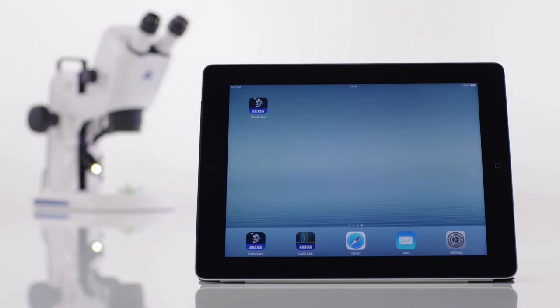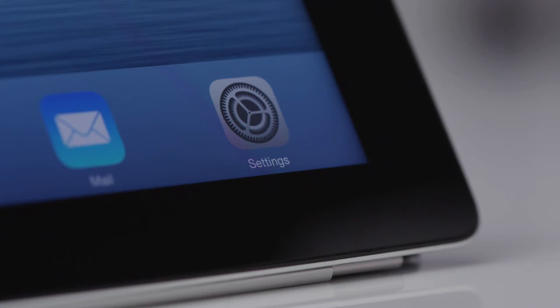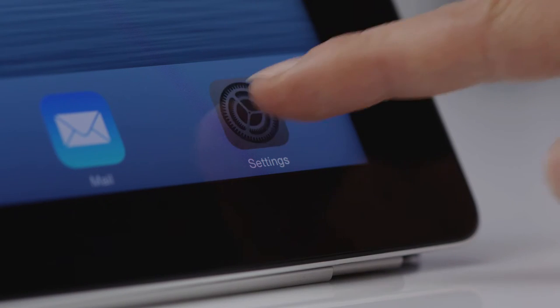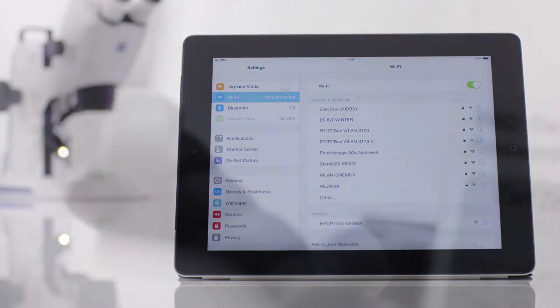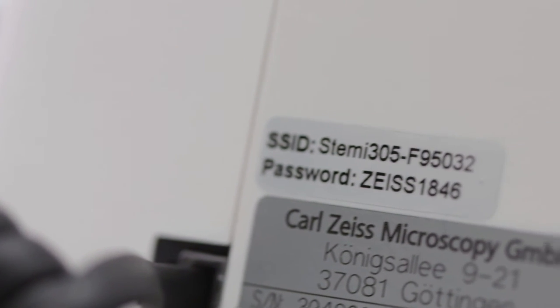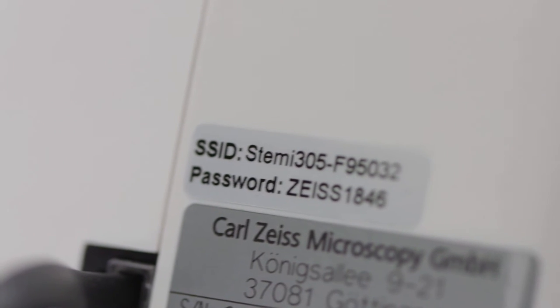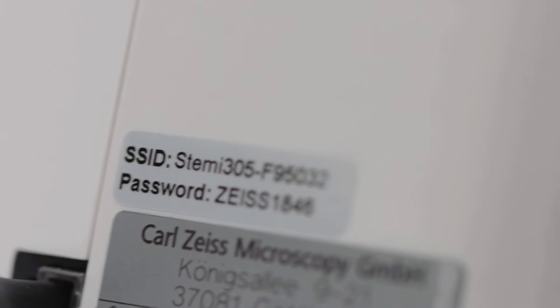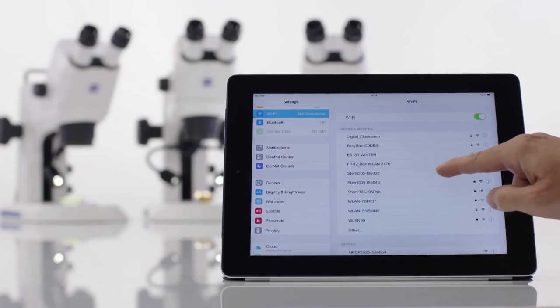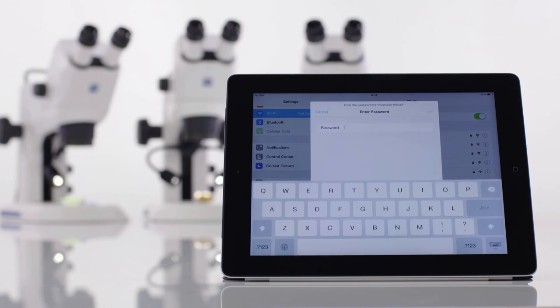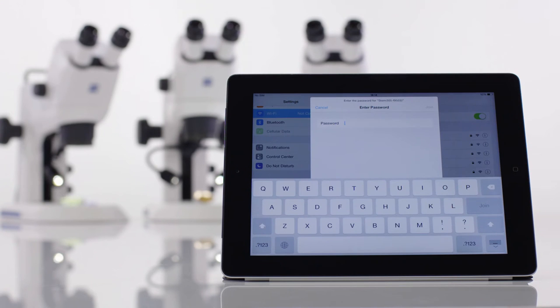Now connect your iPad to the microscope's Wi-Fi network. First, open the Wi-Fi settings of the iPad. Then search for the Wi-Fi identifier (SSID), which you will find on the adhesive label on the back of the microscope body. Enter the indicated password.